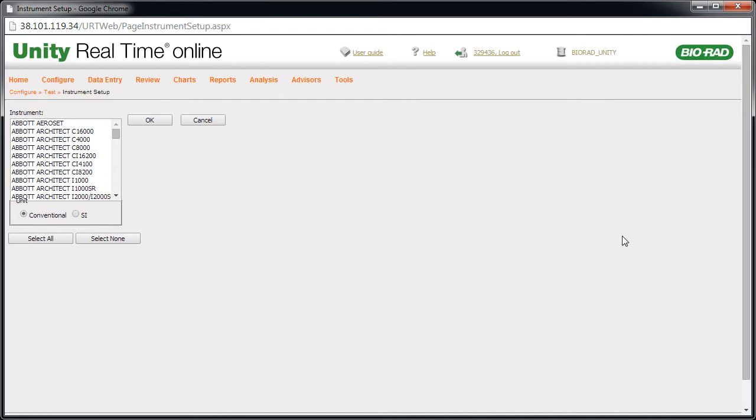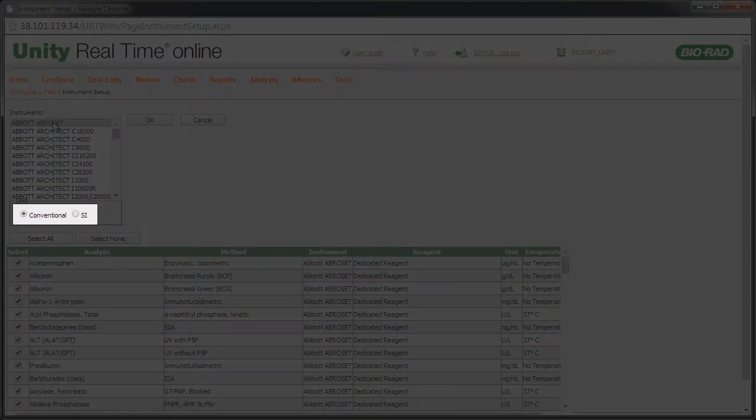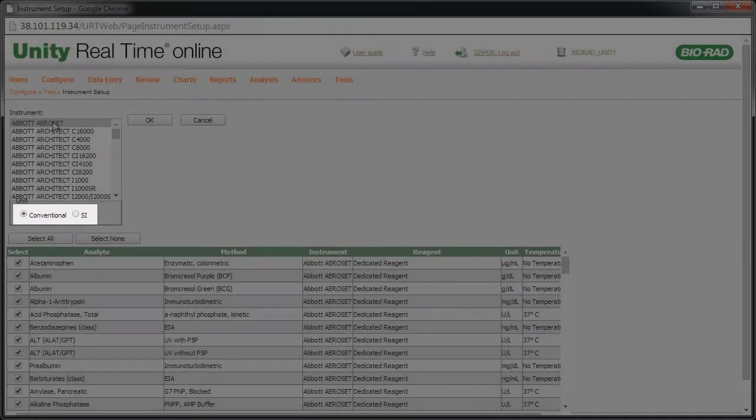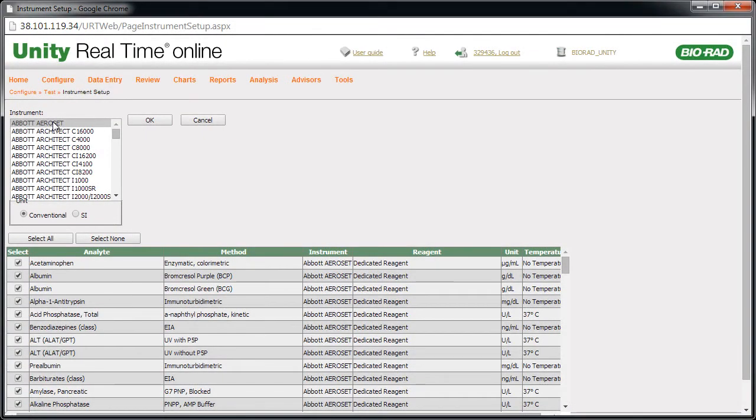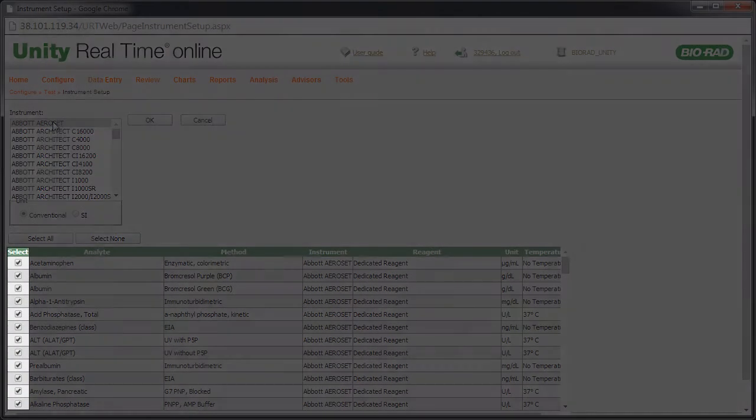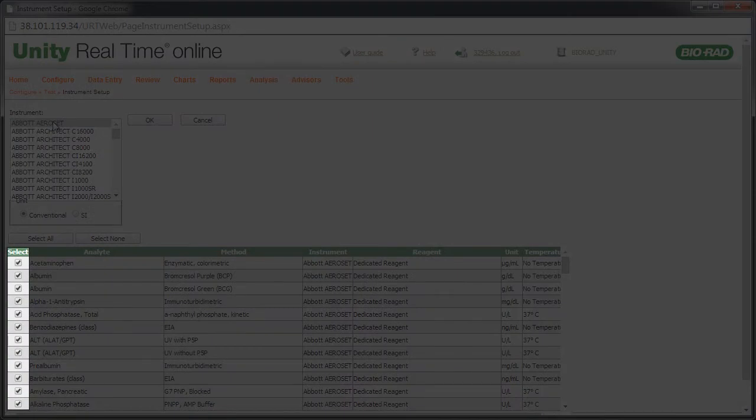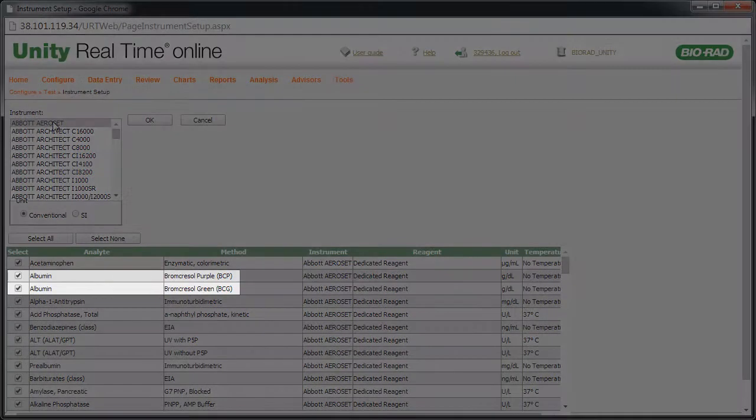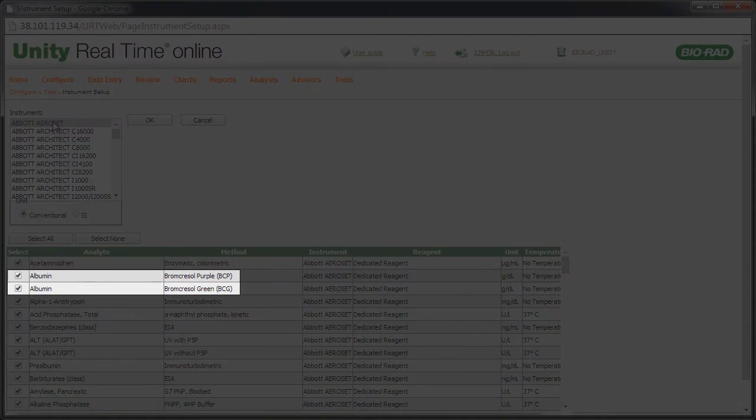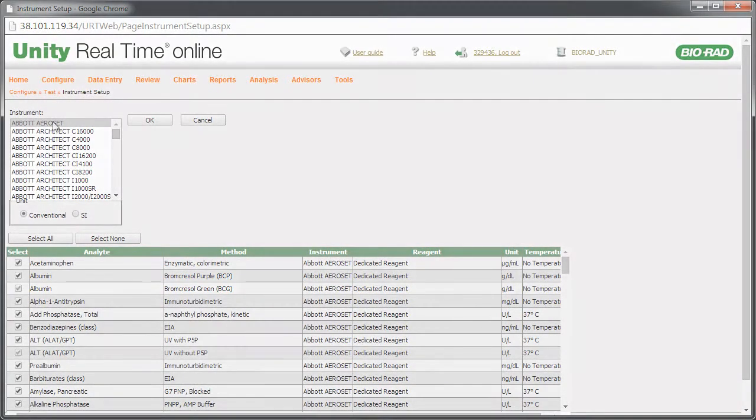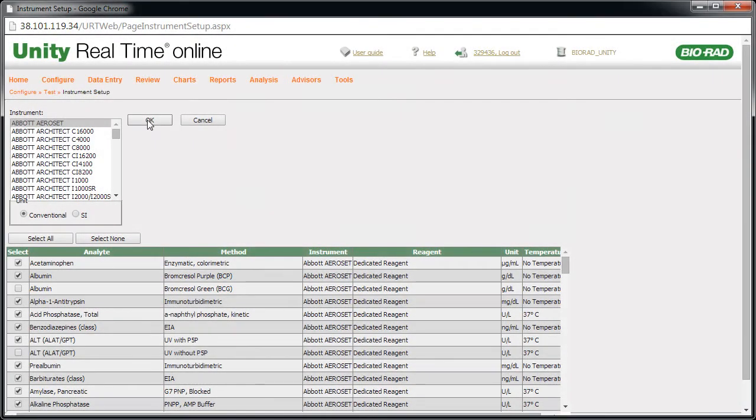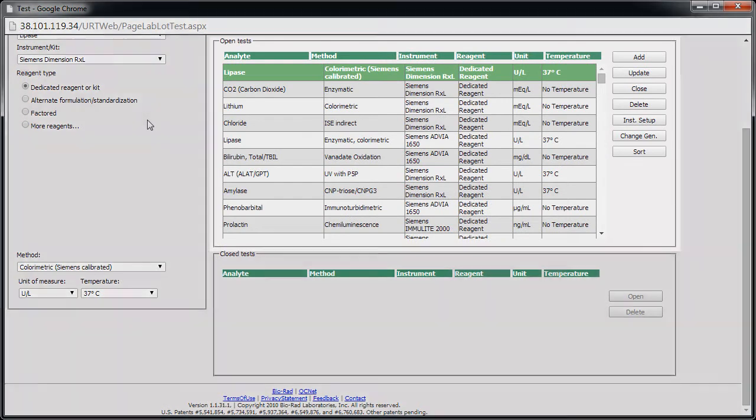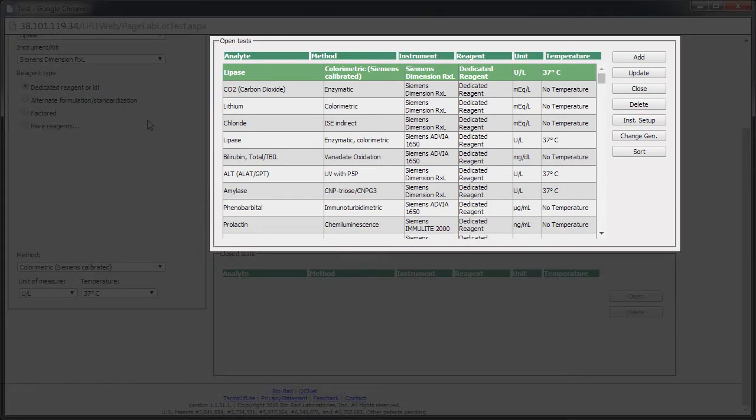Select an instrument. If your instrument is not listed, please contact Biorad, but you can use Manual Setup to proceed. Verify that the unit selection is correct. All tests for the instrument are selected by default. It's possible that two equally valid versions of the test appear. Clear the checkbox for the tests that you do not want to add. Click OK. The new tests appear in the Open Tests list.